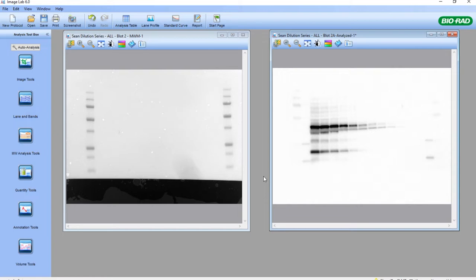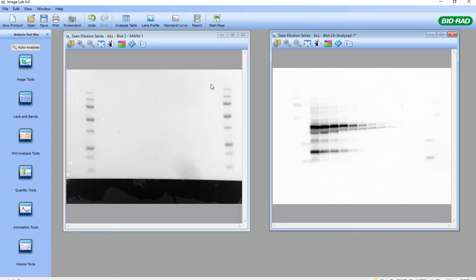What we have here are two images. The chemiluminescent image on the right is a western blot from a 1-in-2 dilution series of a protein lysate, where we detected a particular protein. On the left, we have the visible image from the membrane using colorimetric mode in ImageLab software, and chemiluminescent mode for the acquisition of the chemiluminescent image. Once we have the two images taken and saved, we need to merge them to perform molecular weight analysis.